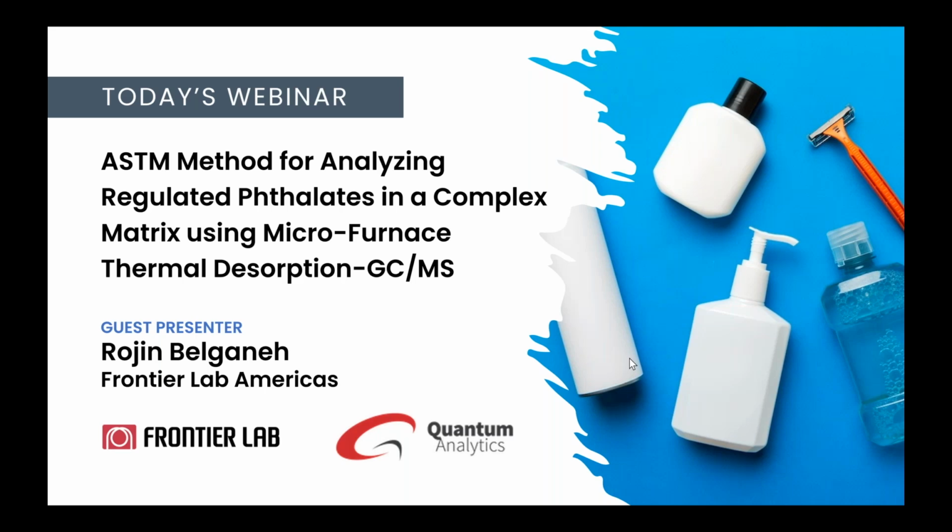Today, we're going to be exploring how to identify and quantify regulated phthalates in complex matrices using the microfurnace thermal desorption gas chromatography mass spectrometry technique based on the ASTM method D7823.